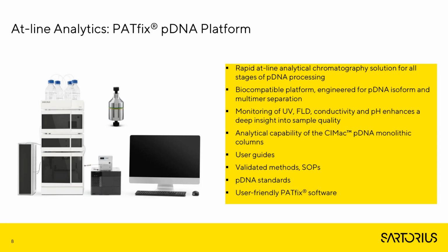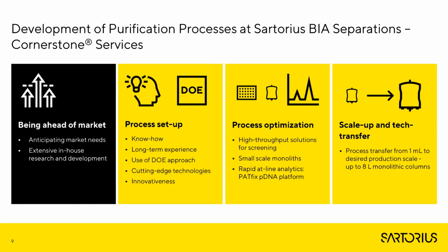And I'll be showing examples throughout, and then Tristan will pick up and take this forward also in the field of LNPs, how we can really benefit from having a PATFIX system embedded in our process development and quality workflows to give us the information we need when we need it, and not a week later. Before I get to that, let's just ask a very simple, basic question.